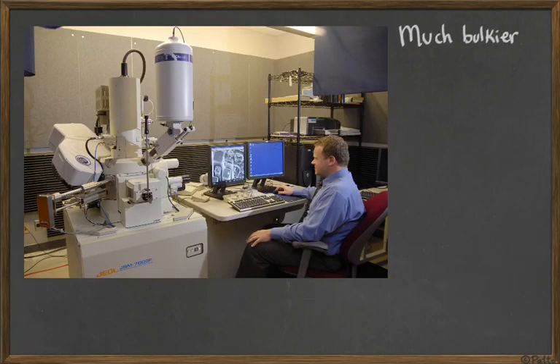The problem with electron microscopes, in addition to being black and white and only observing dead material, is that they're much bulkier. While you can have one optical microscope that's small, the size of a small computer, that you put on your desk and watch, an electron microscope can occupy an entire room. It's much, much bulkier, much bigger, and it's very, very expensive. Usually it's so expensive that only universities or other research departments are capable of buying them. You cannot have an electron microscope in a school because they are very, very expensive.